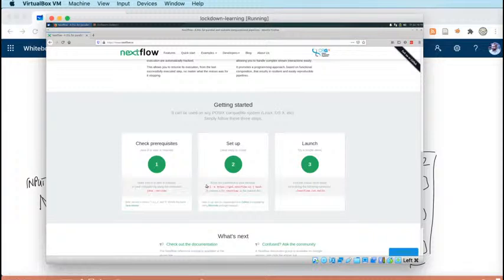So curl is a library which downloads information over the web, so it works a bit like wget, and we've seen curl in various guises before. So this uses curl to download the contents of a location on the web and pipe it into the bash executable. So that is the bash interpreter, which is the thing which normally interprets our commands at the command line.